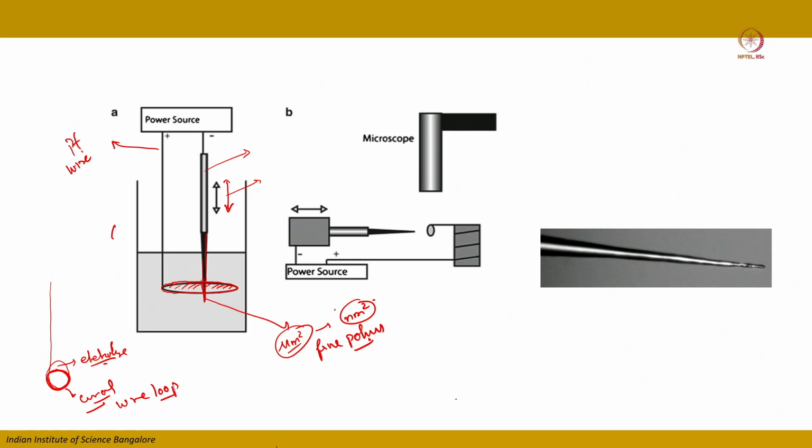And this method is now used most popularly everywhere in several labs, where the rough polishing is done simply by an electrochemical cell with the electrolyte. Once these needle specimens become sharp enough in the micrometer square range, the cross section, then you can prepare a loop by the platinum wire, and due to the surface tension effect, you can suspend the electrolyte on this particular loop.